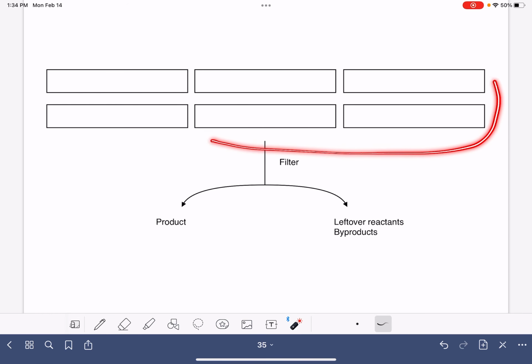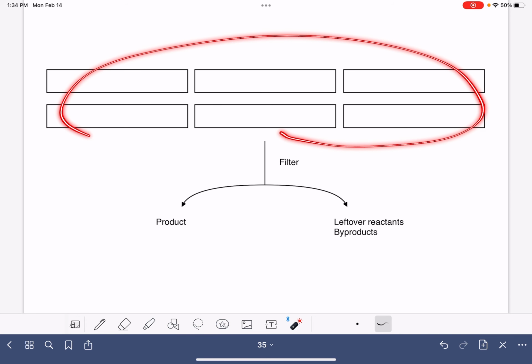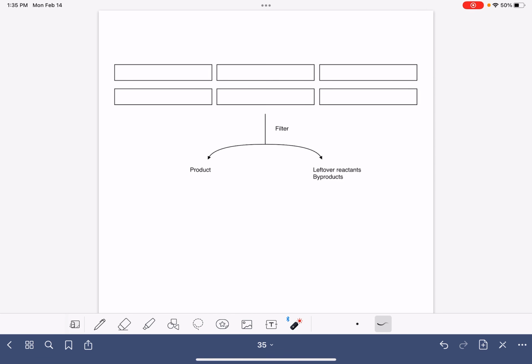So that means you're just going to be putting all of the different substances up here, everything that you combined together prior to the filtration process. We're not including the recrystallization that would happen here. So this is like getting us to the crude product. But there you go.